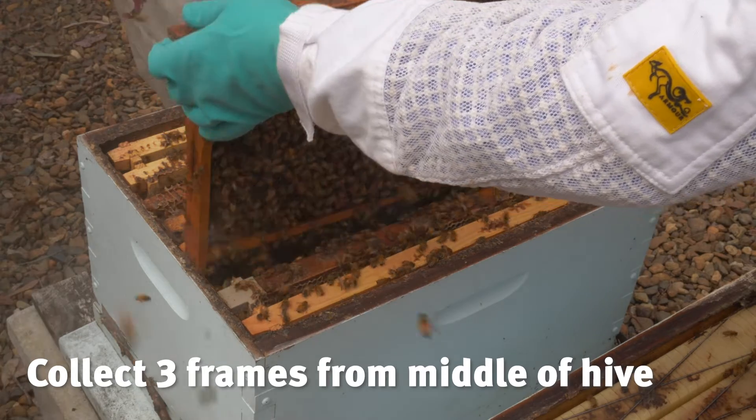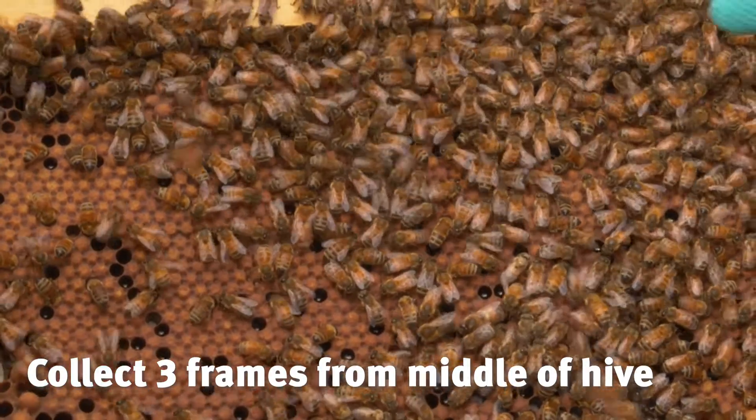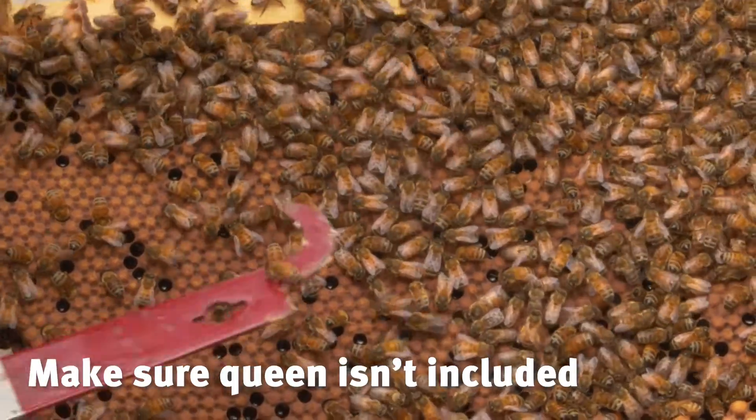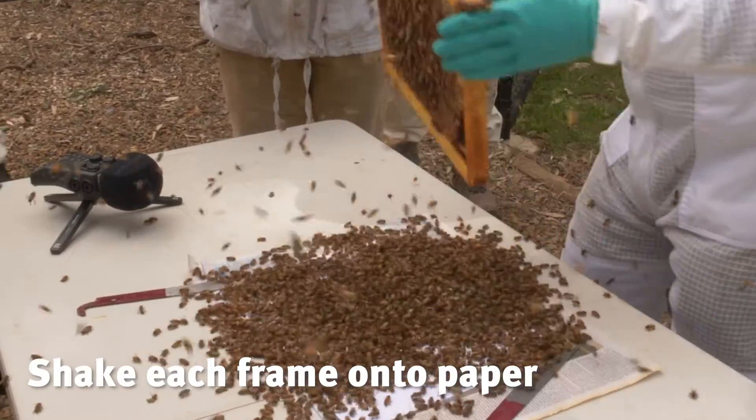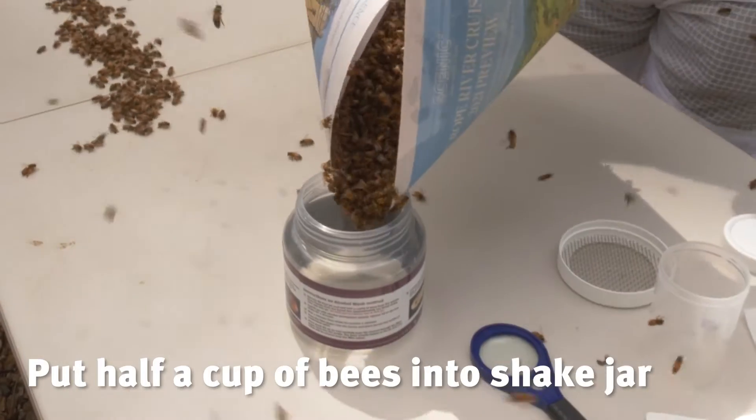For an alcohol wash we need 300 nurse bees from the middle three frames. Make sure you don't include the queen. Shake the bees off onto a piece of paper and transfer about half a cup of bees into the shake jar.